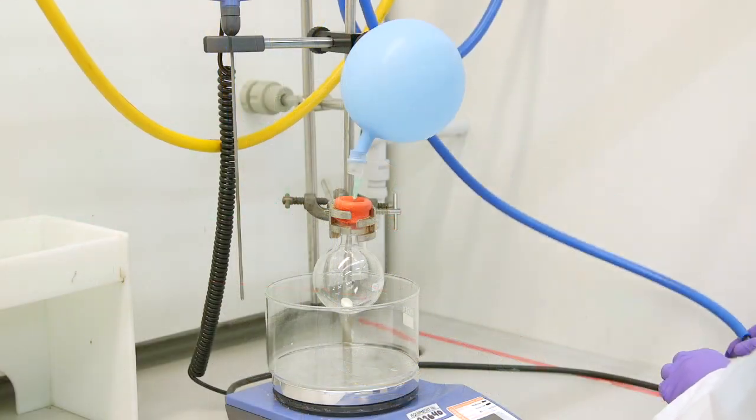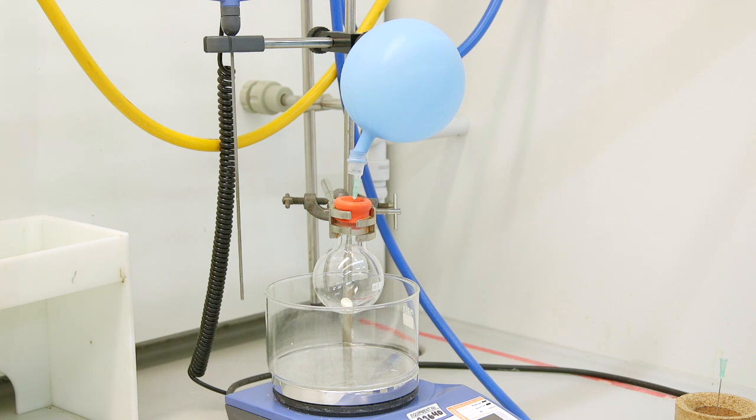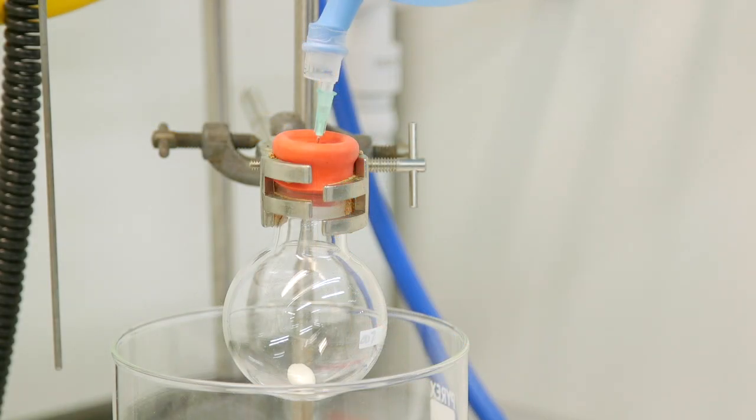We can now say our flask is under an inert atmosphere. To add reagents and solvent to your flask, we traditionally do this using a needle and syringe. This is done so not to expose the atmosphere inside the flask to air.